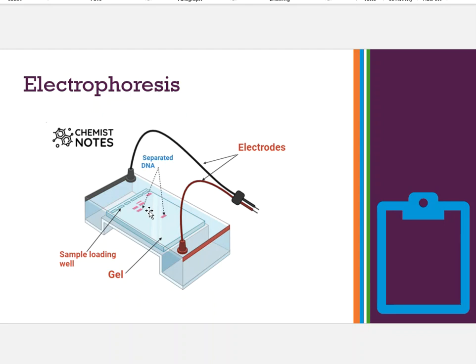So eventually we're going to make it to a point, especially in the lecture discussion here, about electrophoresis and what this thing does. And what you're seeing is a chamber. This electrophoresis chamber is going to be an area that's filled with buffer. This is not water. Buffer is really going to be needed here because we're playing off on charges, and that buffer is going to be very important.